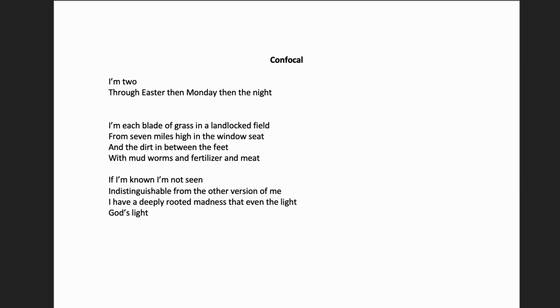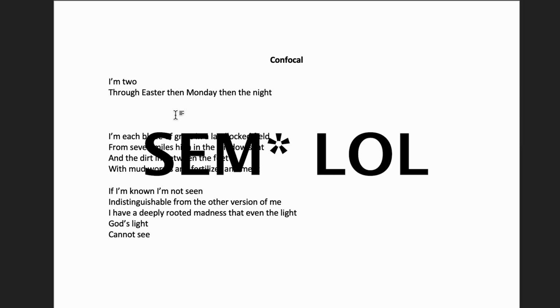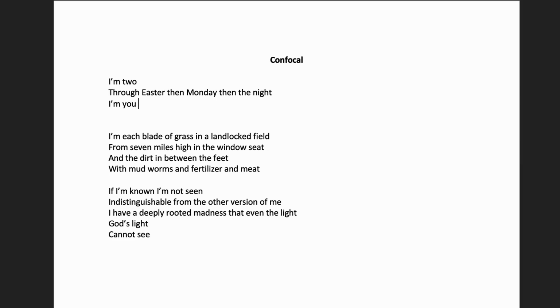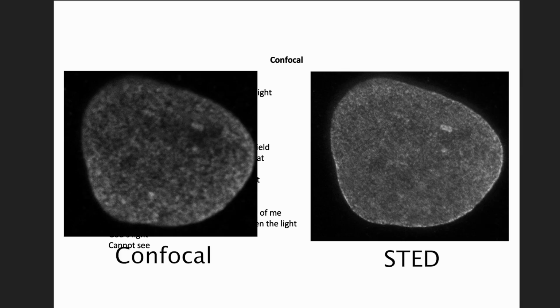And I will probably soon talk about something called super resolution microscopy. Again, you have tier lists of different versions of microscopy. It goes wide field, confocal, super resolution, maybe SEM, scanning electron microscopy, I think. I've only done one version of super resolution microscopy, which is called STED imaging. I will insert a picture of STED imaging here.